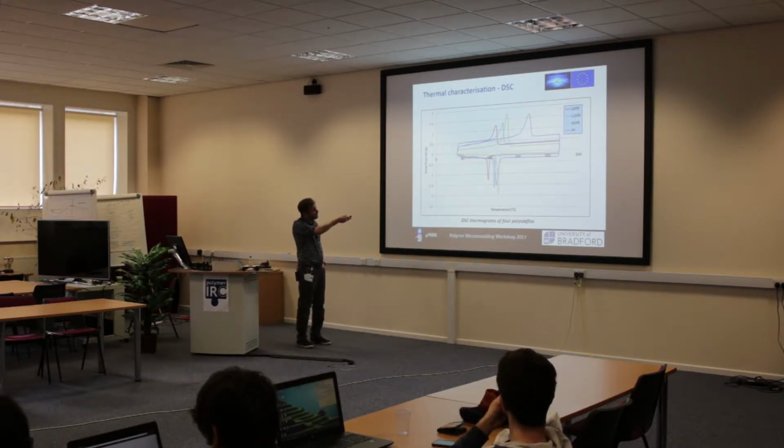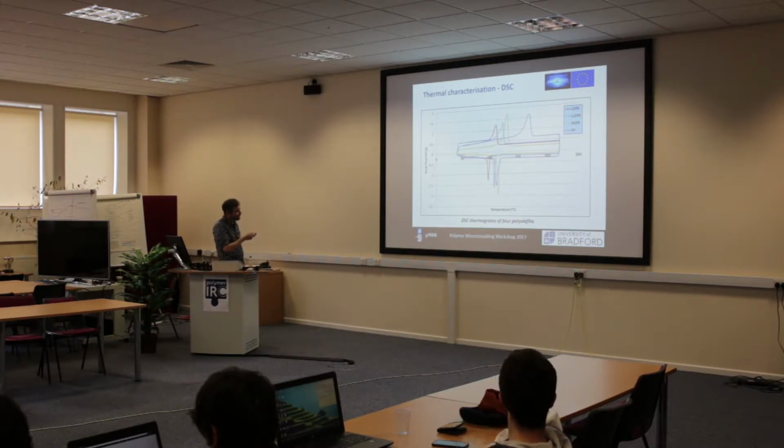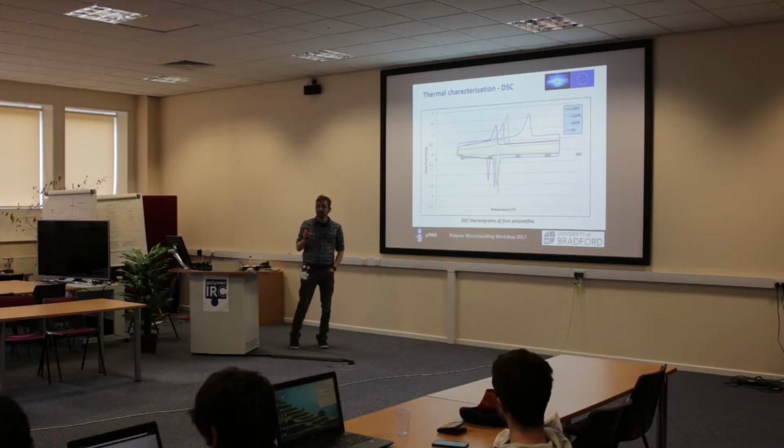So our polypropylene is melting at about 160 degrees C, our HDPE at about 125 degrees C, our LLDPE at about 115, and our LDPE at about 105. Now if we just look at this LLDPE, you'll see an example of what I've just mentioned. This kink on the side of this nice Gaussian curve, which describes our crystal, has this extra kink in. That is associated with a second crystal form.